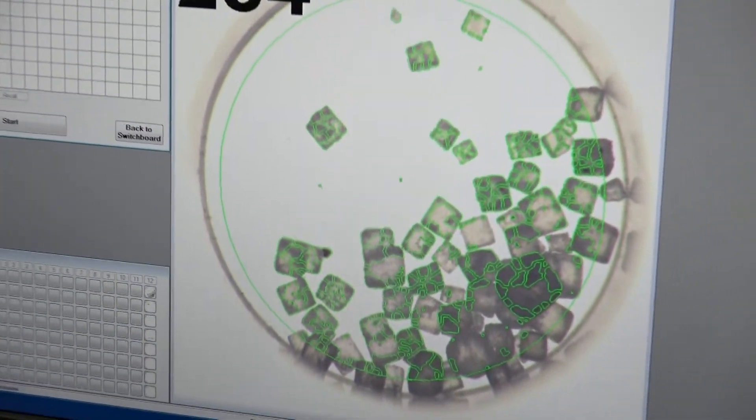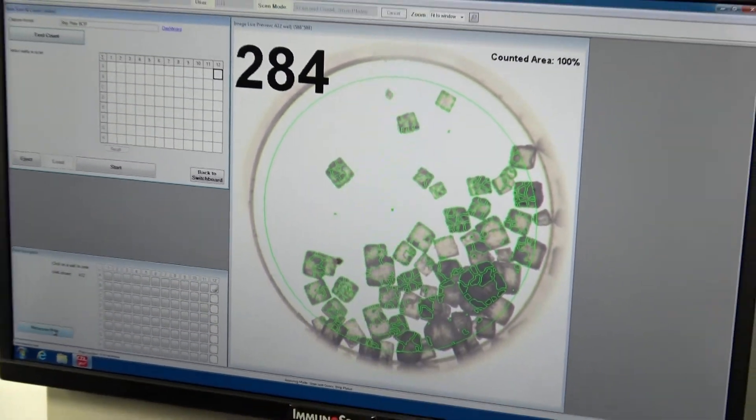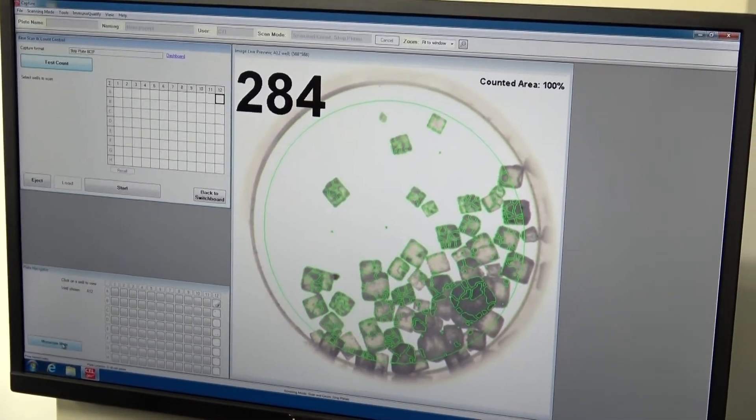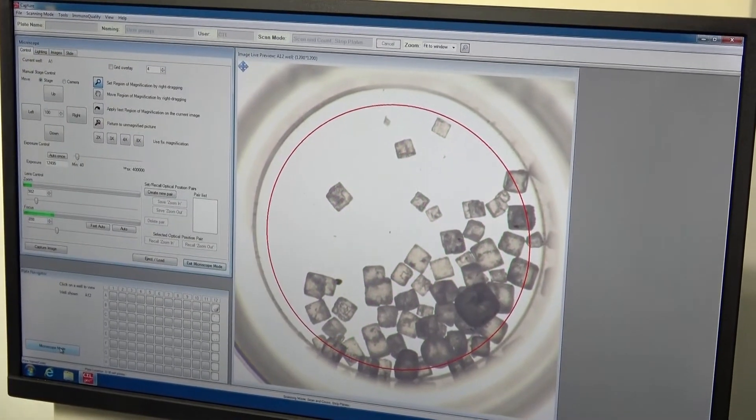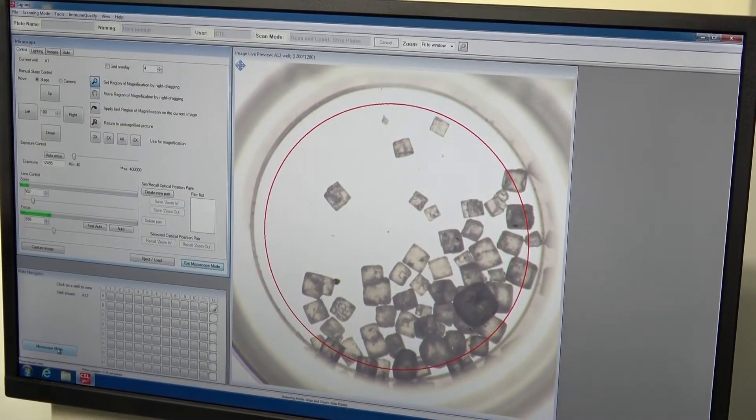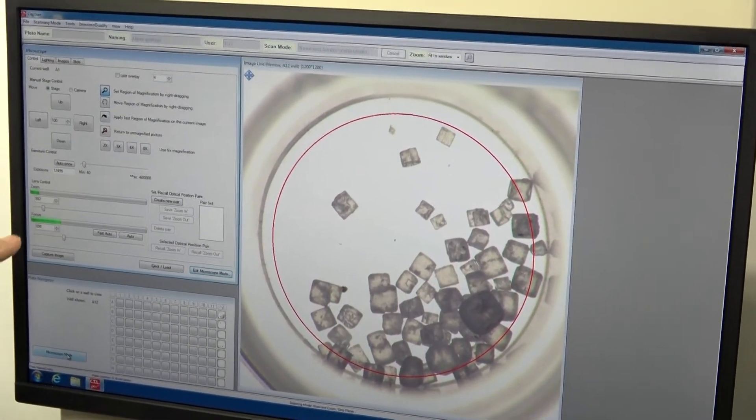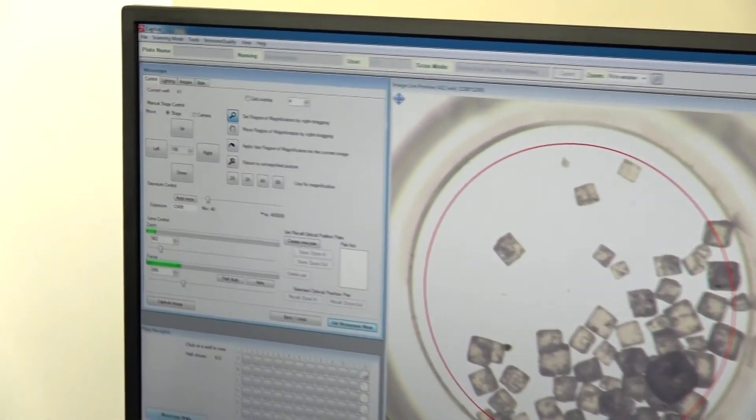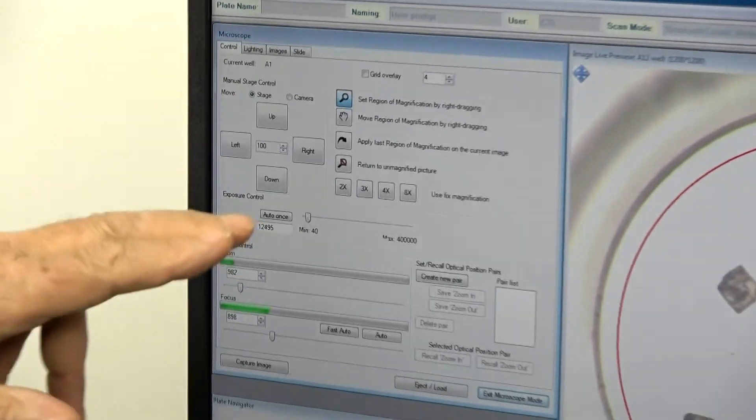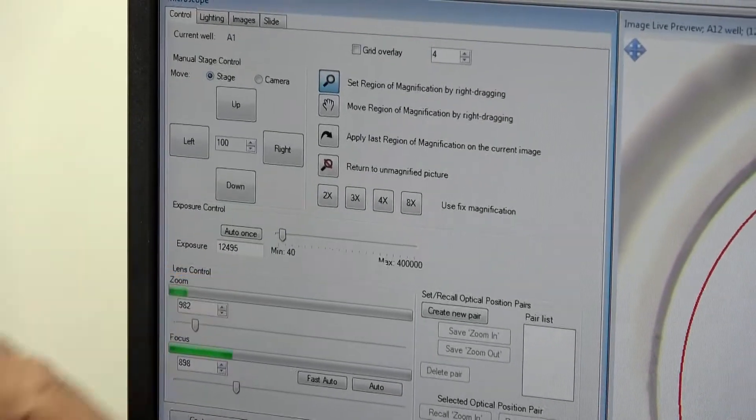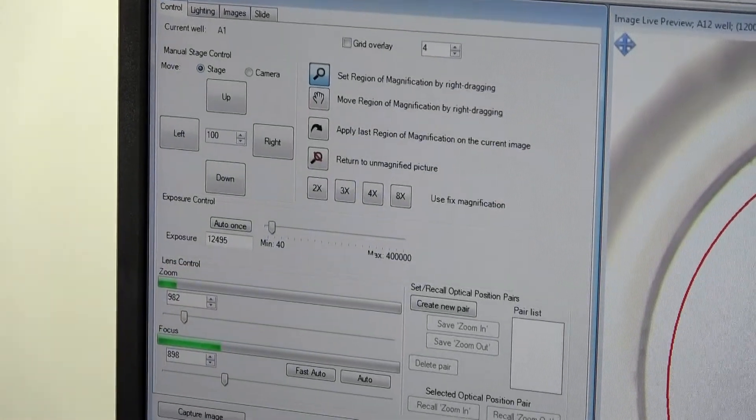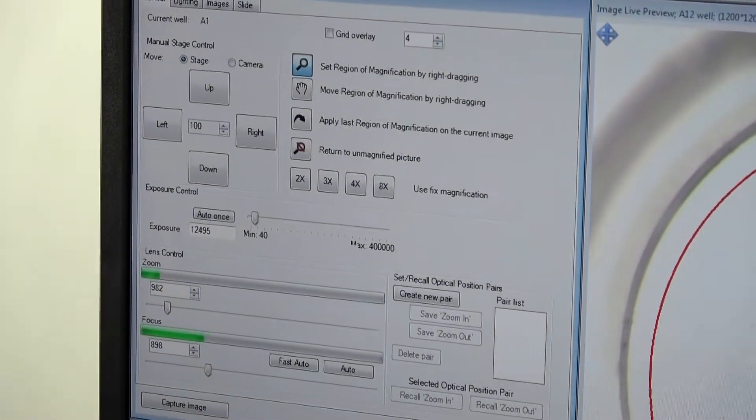We do have some control in microscope mode of the unit, of the focus, how far we want to zoom in on the unit or back.